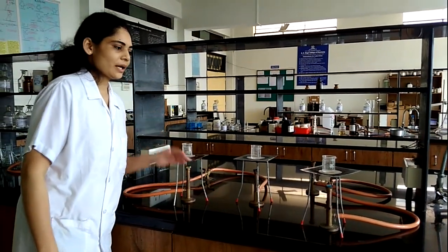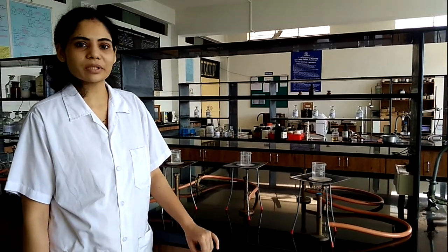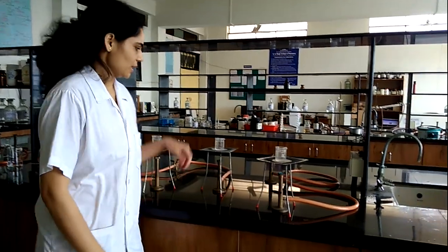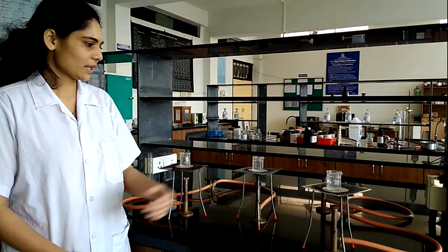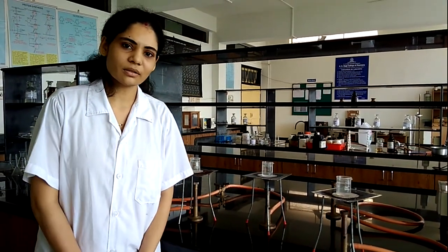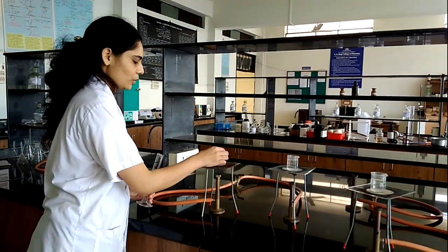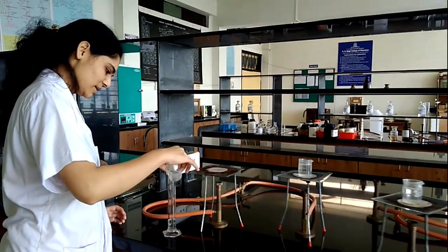Minutes, so about 10 minutes. So now our 10 minutes are over and we will switch off this burner and wait so that this beaker gets cooled, and then we will measure the volume. First we will measure the volume of beaker A. We will pour it in the measuring cylinder.